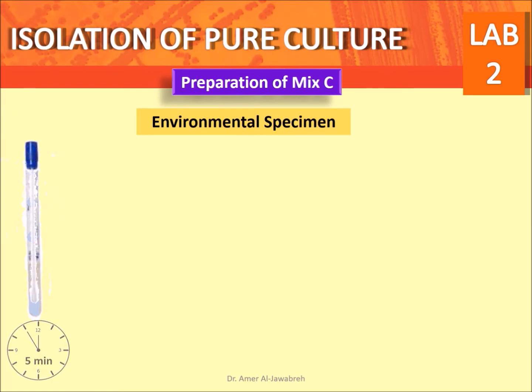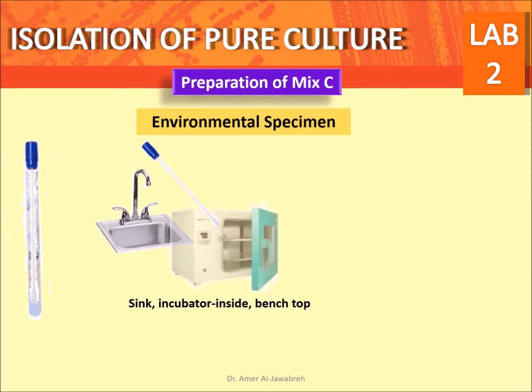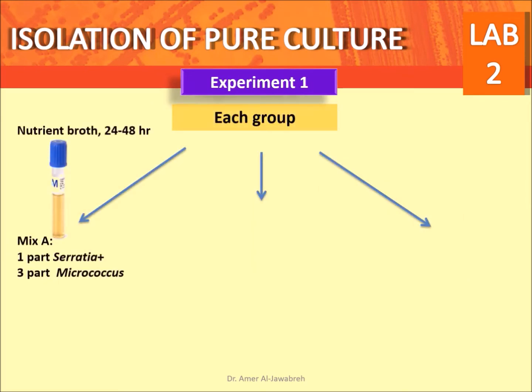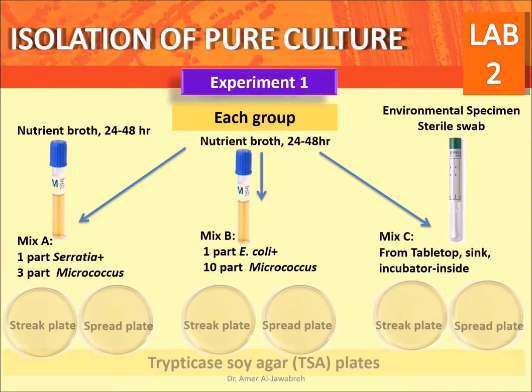The water-soaked swab should be squeezed at the sides of the tube and used to swab the bench top, or sink, or inside the incubator. Allow the swab to soak for 5 minutes again. To each group, distribute 24-hour nutrient broth of mix A, 1 part Serratia to 3 parts Micrococcus. Mix B, 1 part E. coli to 10 parts Micrococcus. And mix C, which is the environmental specimen.